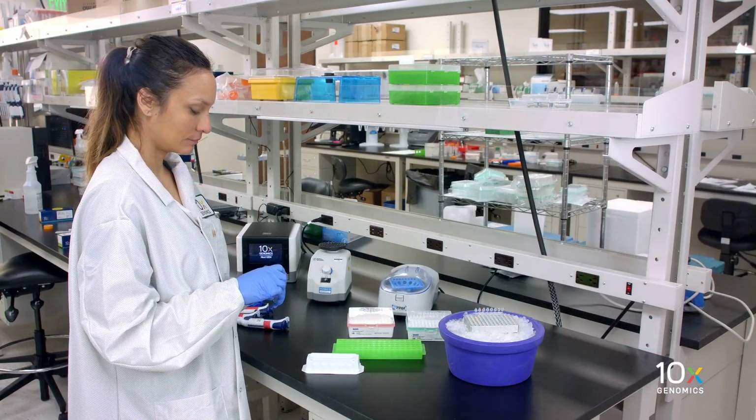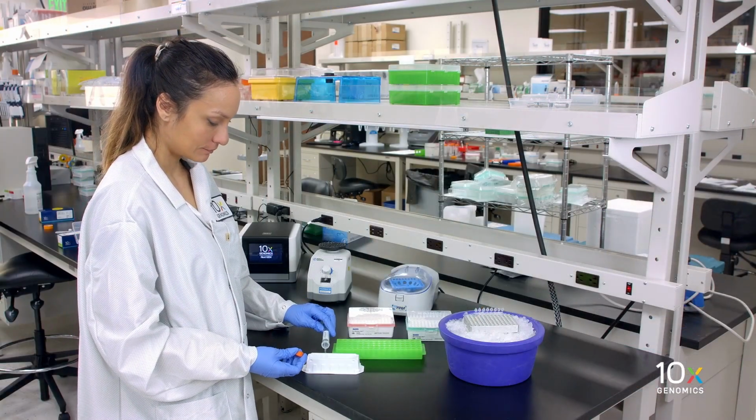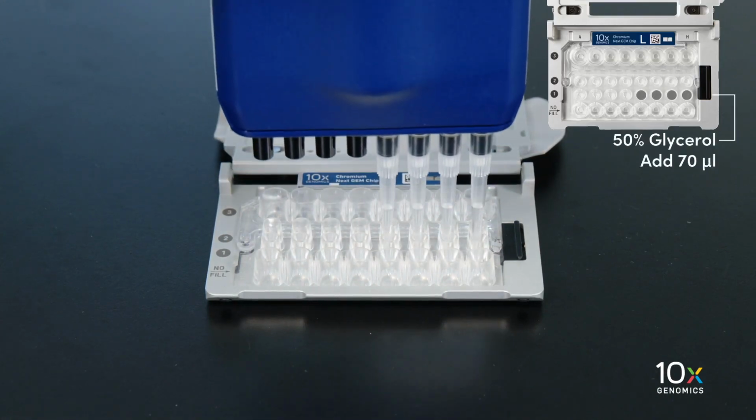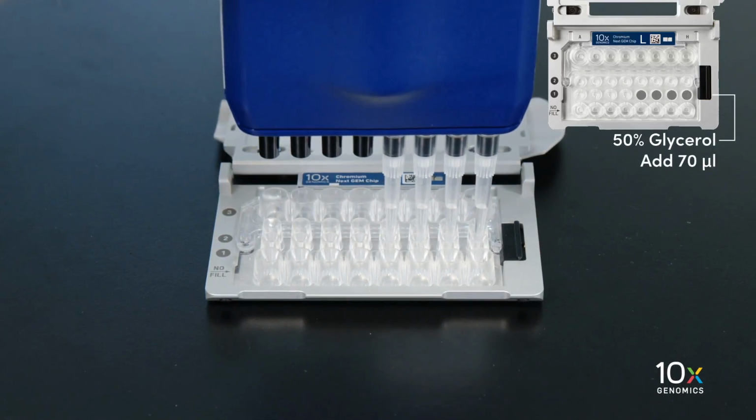If you are loading less than 8 samples into the chip, load 50% glycerol into the unused wells. Today, since we are running 4 samples, we will load 50% glycerol into the remaining channels. We will add 70 microliters of 50% glycerol to unused wells in the row labeled 1.